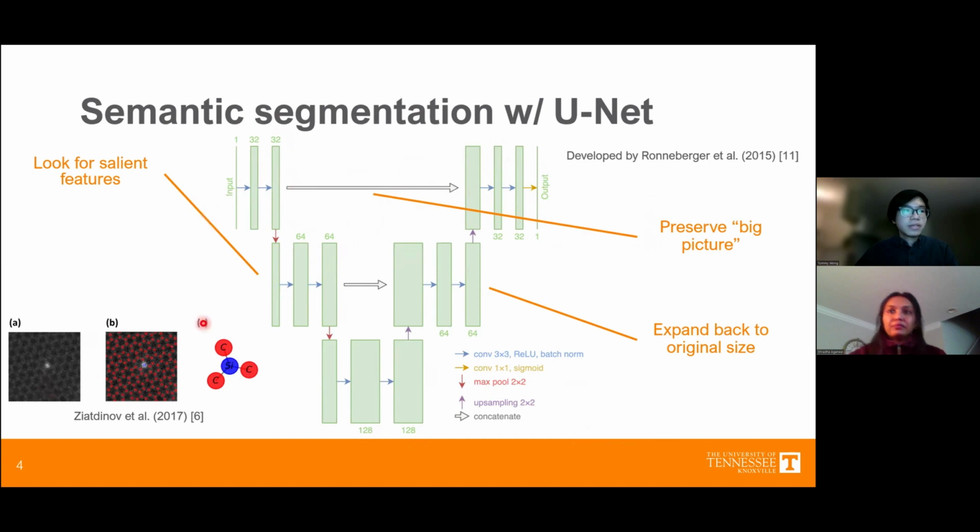And so here is an example in which, using UNets, the atomic locations on this high resolution STEM image could be identified, and it's also identified by the class of the atom. So it shows a silicon carbon defect structure in the middle.